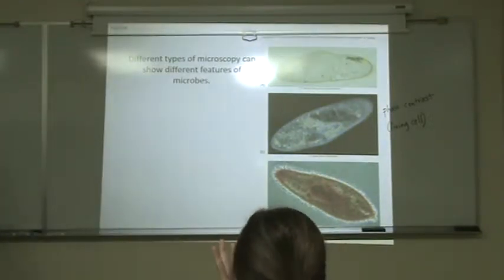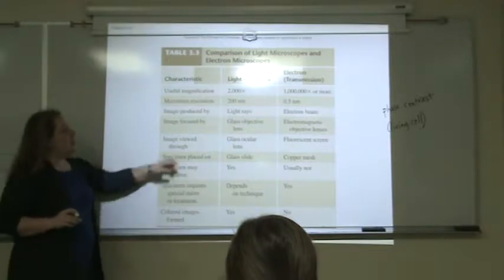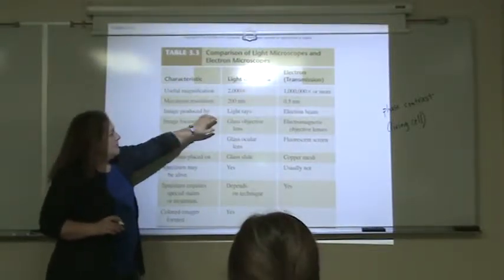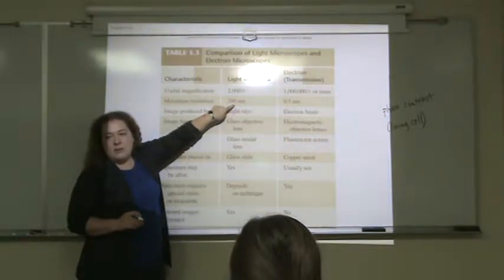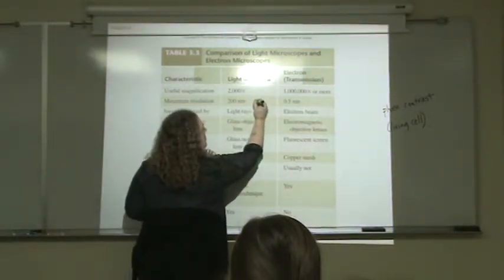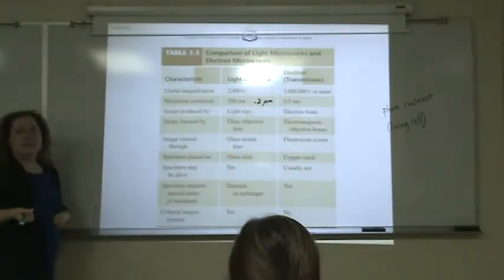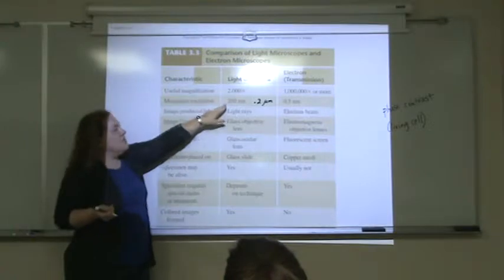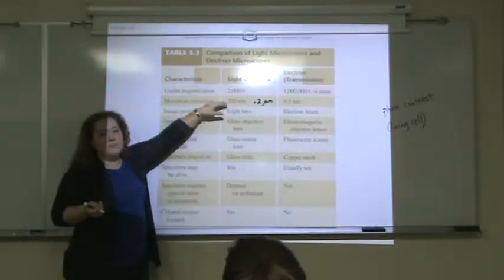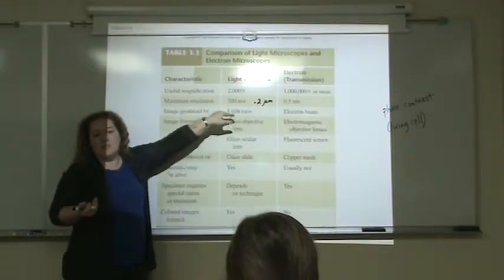The other main type of microscopy where you wouldn't use a light microscope is if your thing is so small. So here's our 0.2 microns. That's the same number. Or 200 nanometers is the same measurement. Anything that's smaller than 200 nanometers, light microscope won't do so well for you. And then you need to go to electron beams.